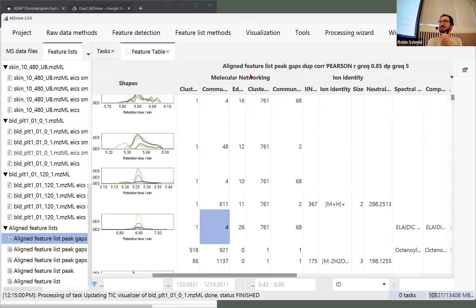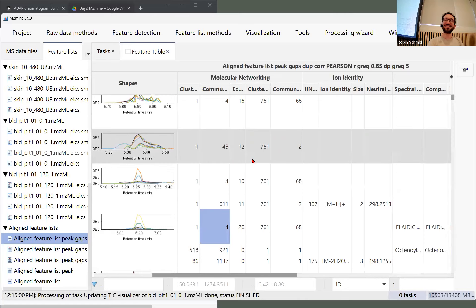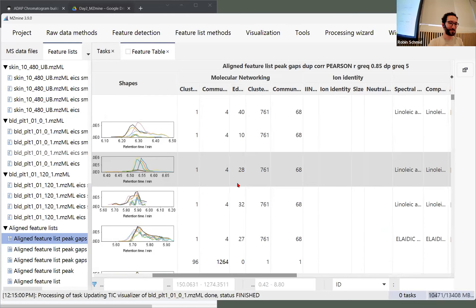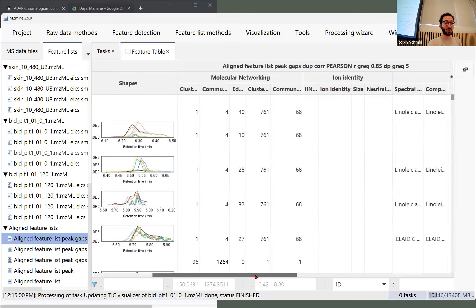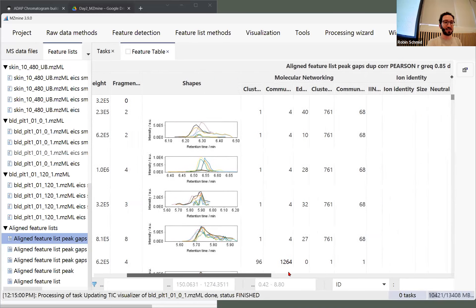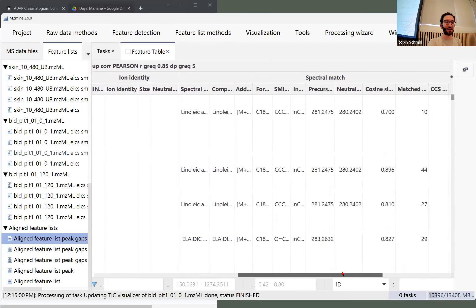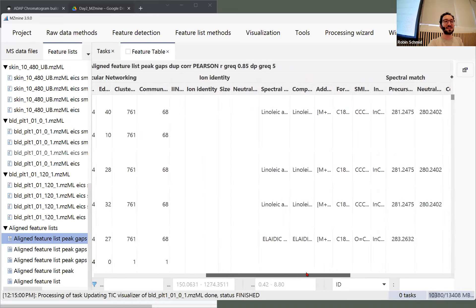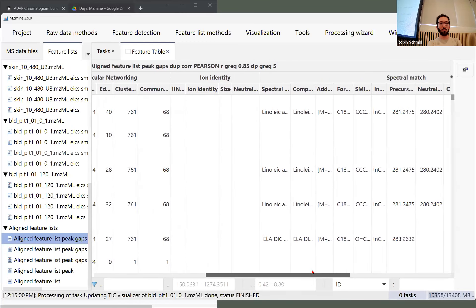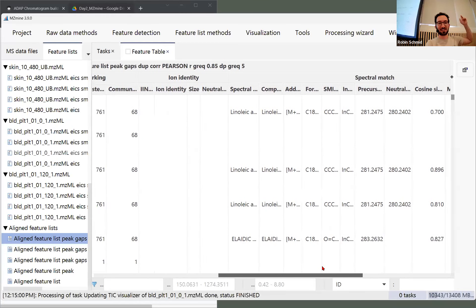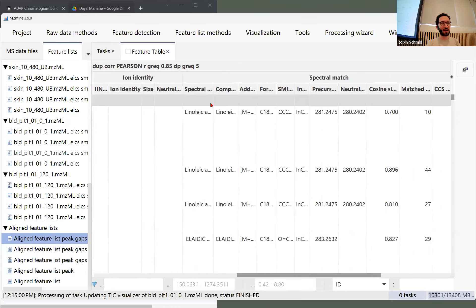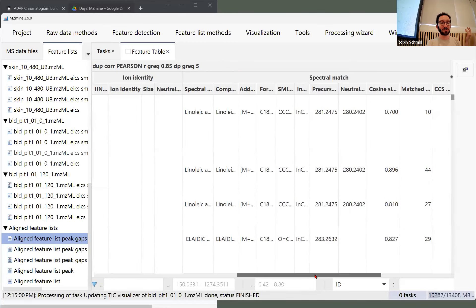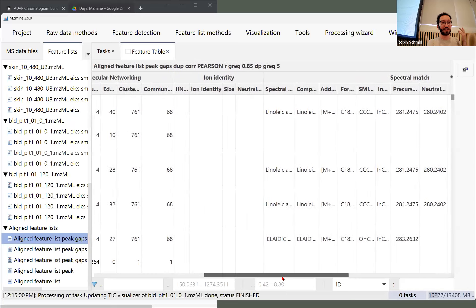Features with no ambiguity — zero extra features — are the ones we can really use to get maximum shifts in our sample. Getting rid of the alignment columns, in the feature list you can see it looks way more complex than the slides showed.